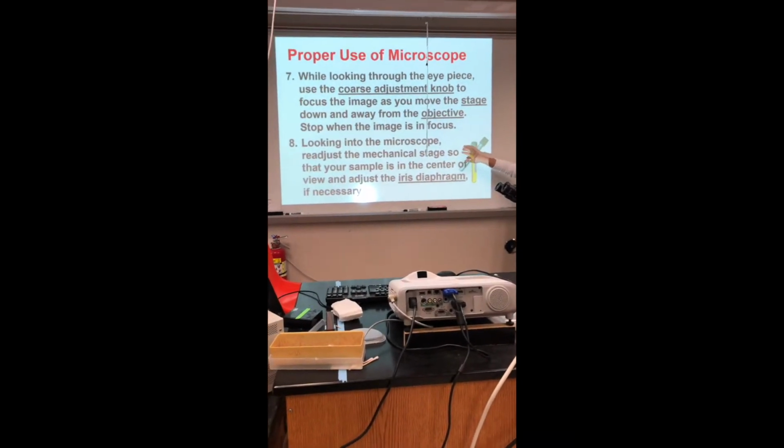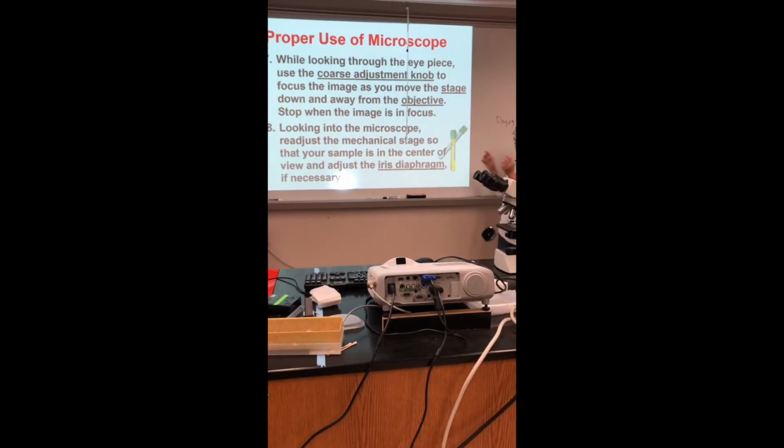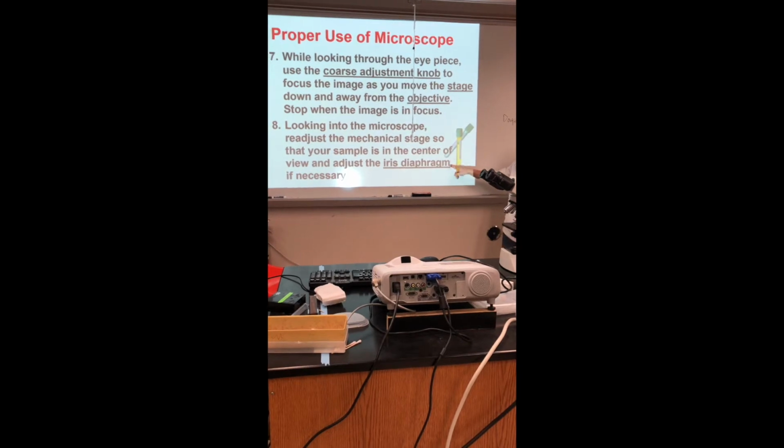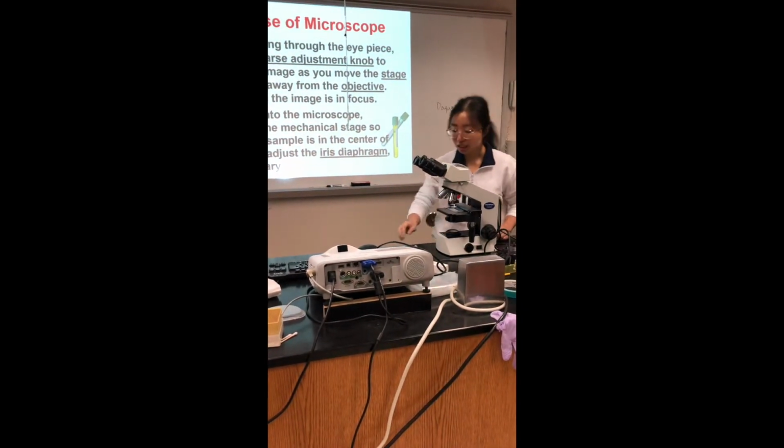Looking into the microscope, readjust the mechanical stage so that your sample is in the center of view, and use the iris diaphragm if you want to adjust light intensity.